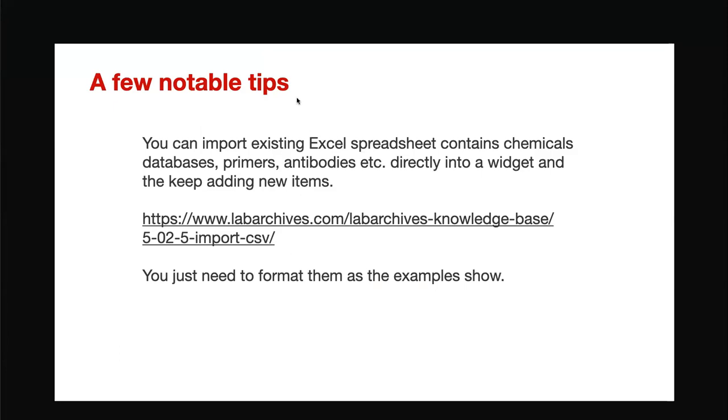Yeah, you can import everything. Import a spreadsheet that contains a chemical database. So if you currently have in your lab an Excel spreadsheet with all the reagents that you're using, you can import it in one of the widgets, and it's going to show in a nice, searchable table. And this is the link, and you can go there, and it's going to show you all the instructions.